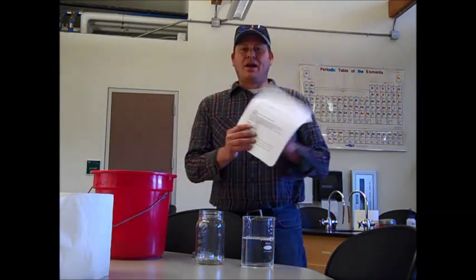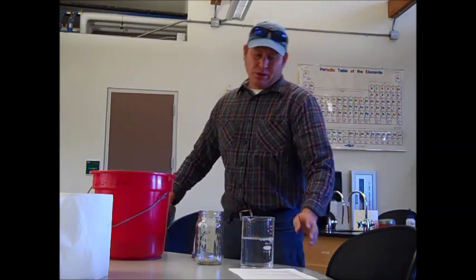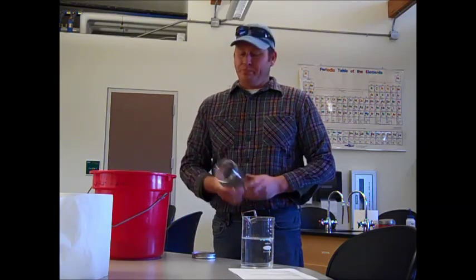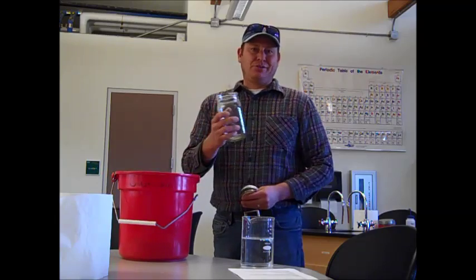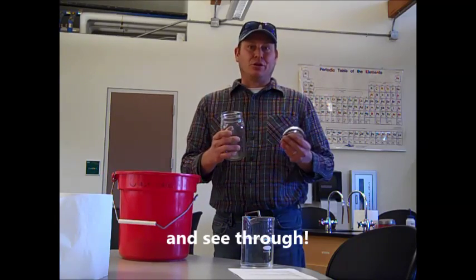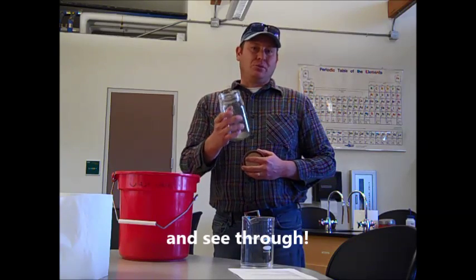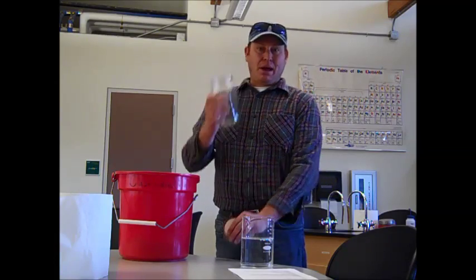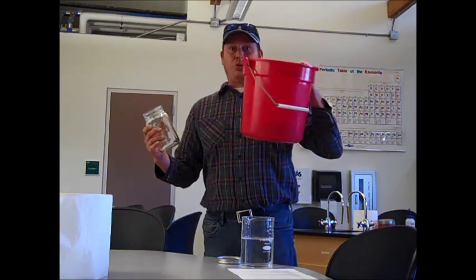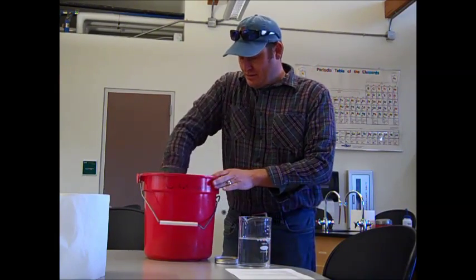Okay, now I have my soils lab that I printed out, and the first thing it talks about doing is sedimentation. So this is very simple. You have these materials at home. I just use a glass jar with a lid, any container that you can add soil and water and close up and shake is a container that'll work for you. As far as the volume goes, you want just enough so you'll be able to read those percentages. So in my case here, I'm taking our soil that we just collected, our homogeneous sample from around our area.